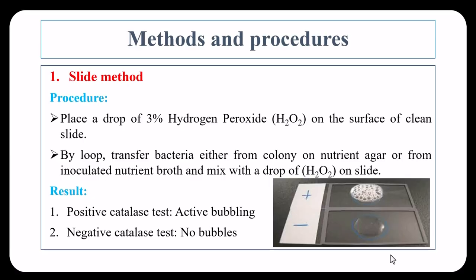The result, positive test, will be indicated by the active bubbles, while the negative test, there are no bubbles. And bubbles will appear quickly, which indicates the positive result.